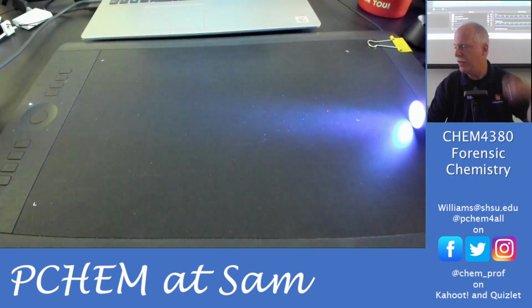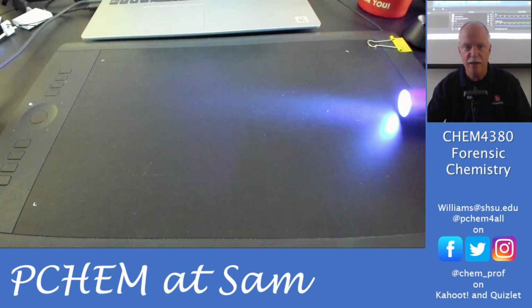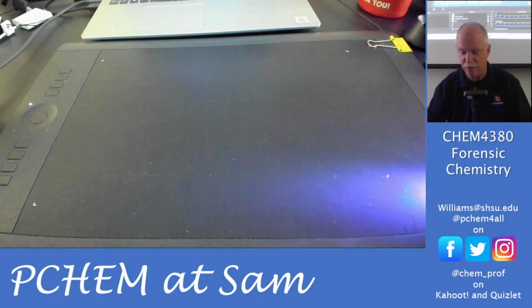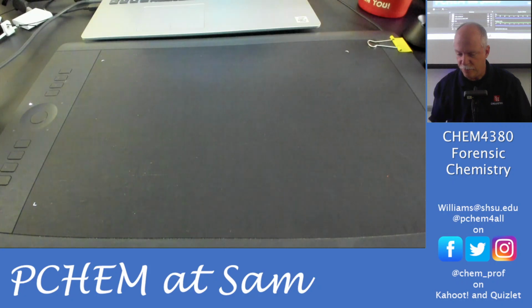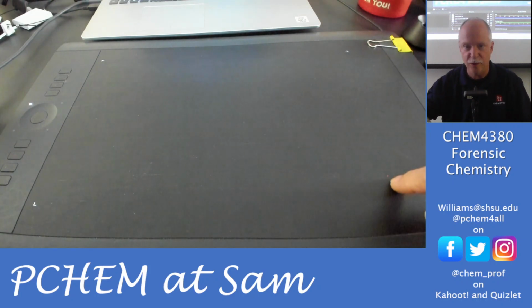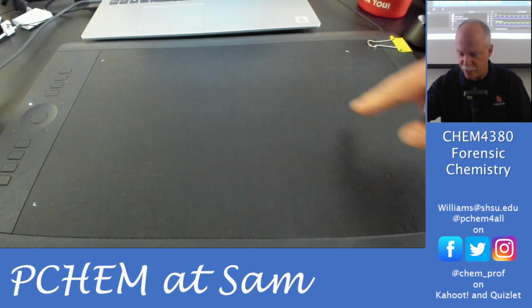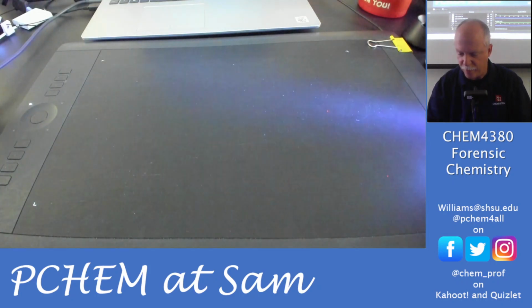Just me picking up that fluorescent fingerprint powder, some of the little particles fell out of the lid and have hit my little tablet right here. And there's another one right here. Now, with my eye, I really can't see anything special on here. I mean, I can kind of see this particle here because I knew where it was. I've lost this one up here, so I really can't see it with my bare eye, but there it is.